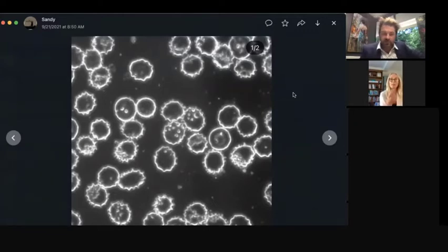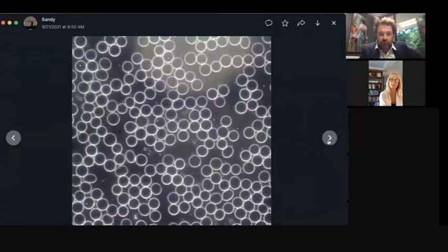Yes, so that image was taken from the injection site of a patient of mine who'd had the injection a day before. I think it was the AZ injection. So just as a comparison, this is your blood.